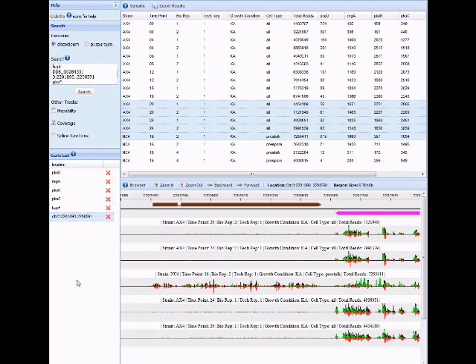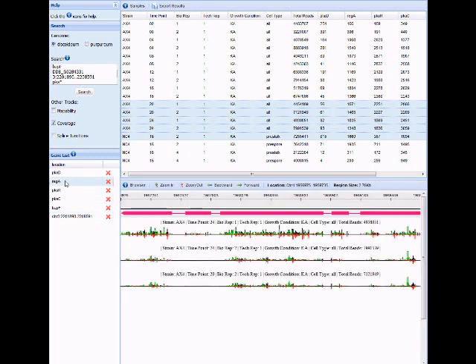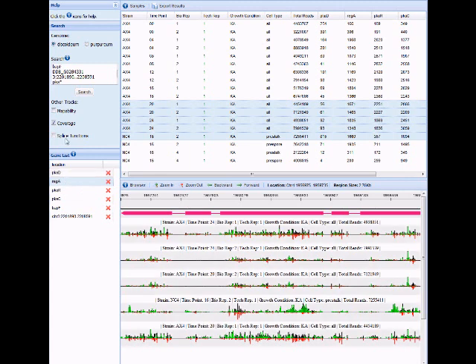You can move between regions that you've previously searched for by clicking on the gene list panel. You can see additional tracks which are available in this other tracks panel.